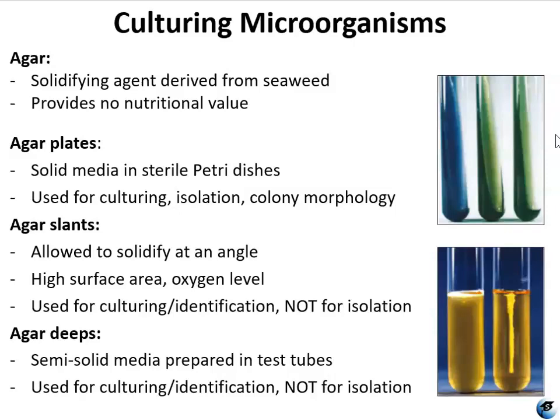So anytime you see agar, whether it's an agar plate or an agar slant or agar deep, you know that that is a solid media because it has this solidifying agent called agar in it. Then you usually have plated media that they're typically used for attaining isolation of species. We'll talk about isolation in a bit. They're also used for differential testing and quantifying bacterial densities.